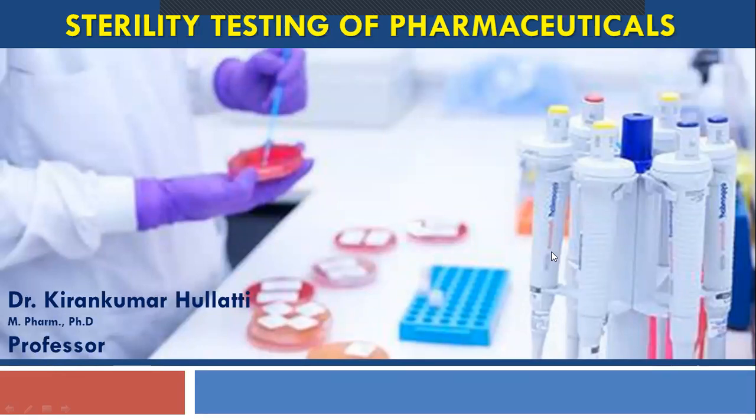And that growth is because of the contamination during the testing, not from the product. But the result we get is that the product is contaminated, so the product doesn't pass the sterility testing. This is called a false positive test. That means even though the product is sterilized, the report says it is not sterilized. Then what about a false negative?